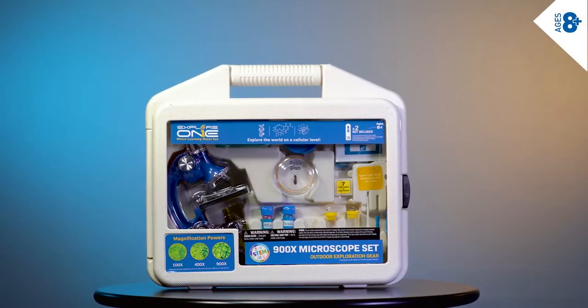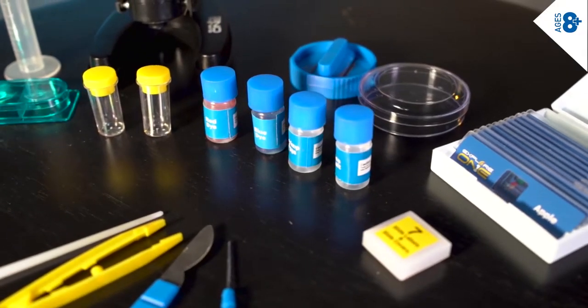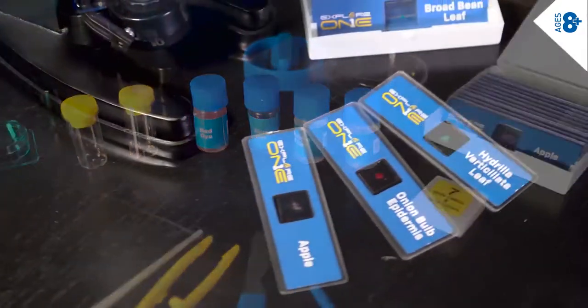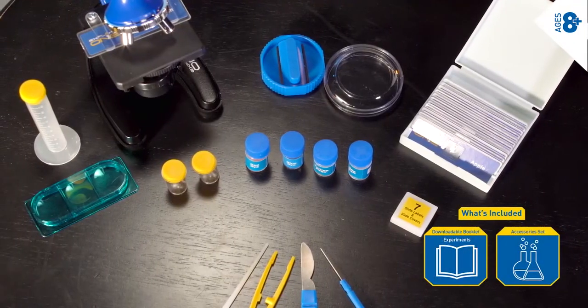The original classic 28-piece 900x microscope now gives you more than 45 pieces in the set. Included are all necessary tools for observing and preparing slides, hatching real brine shrimp, and gathering specimens collected in the field.